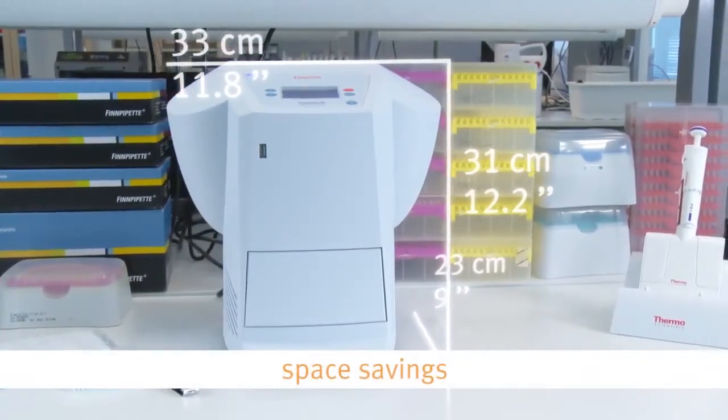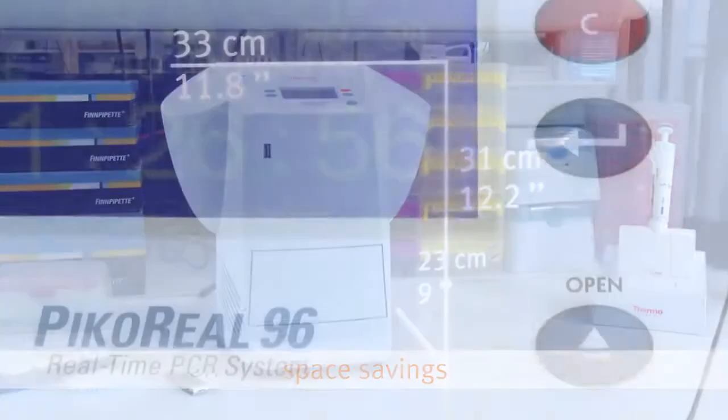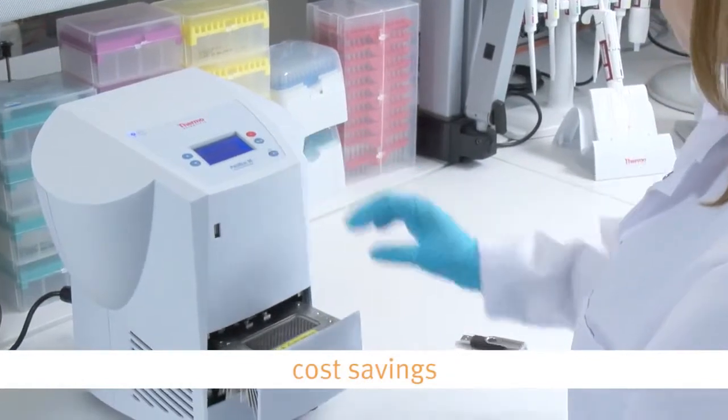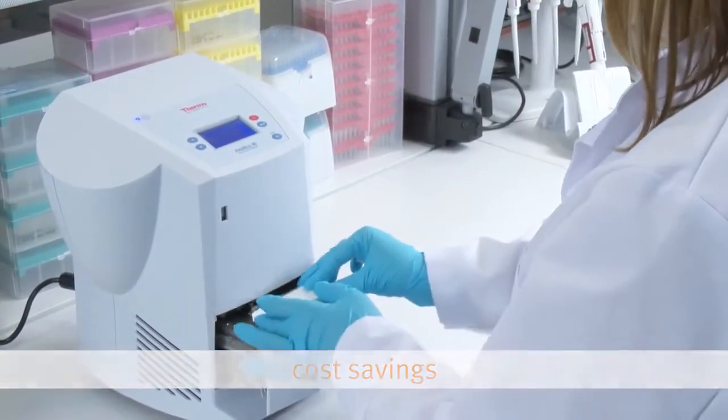In addition to space savings, with PicoReal you get time savings, being able to run fast qPCR with an instrument next to you, and significant cost savings from low sample volumes, consumable costs, and unlimited access to the software.